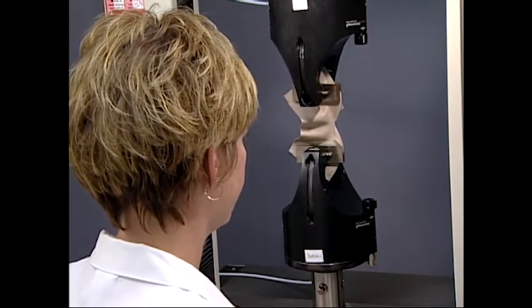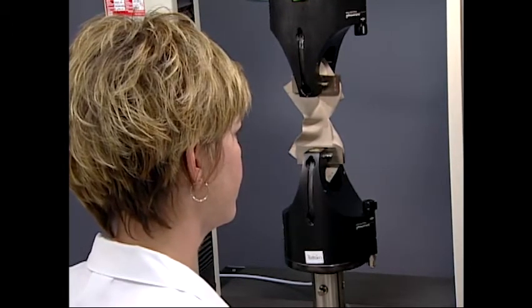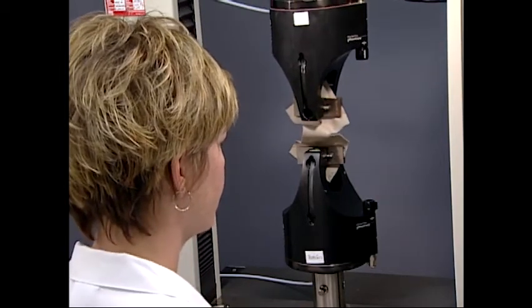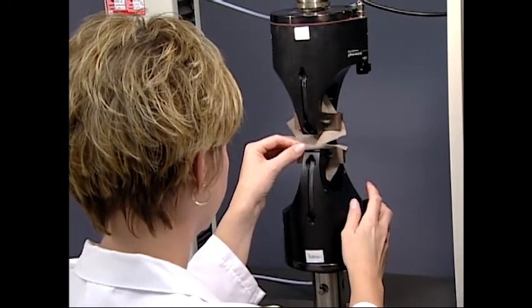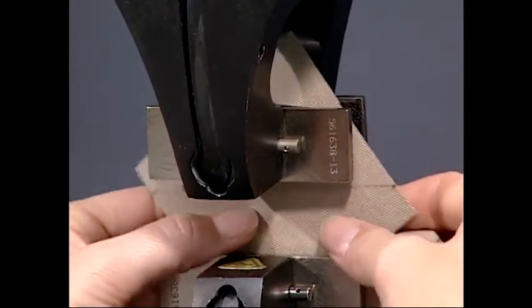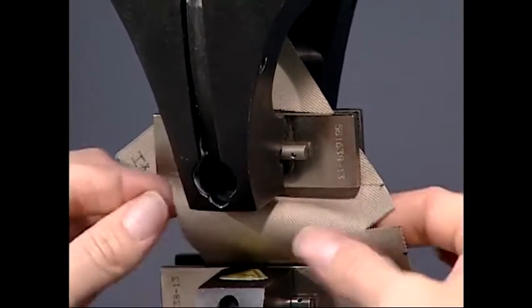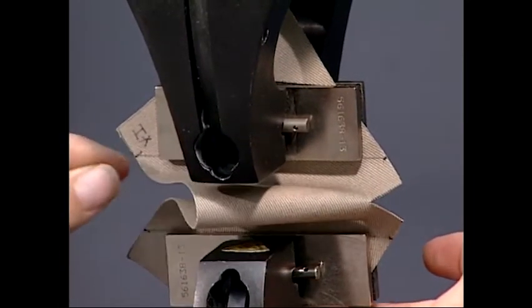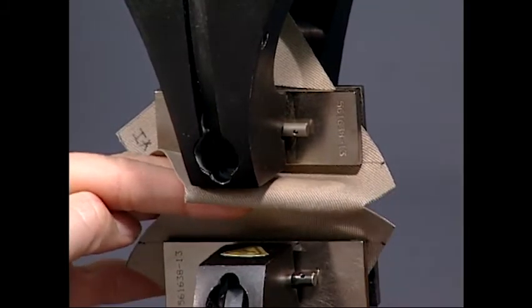The non-parallel edges of the trapezoid specimen are clamped into parallel jaws of the tester. A continual force is applied by the separation of the jaws to propagate the tear across the specimen. Simultaneously, the resultant force is recorded. Depending on the construction of the specimen, the tearing force may be represented in the form of a peak or peaks. High peaks reflect the strength of the yarn components, individually or in combination, needed to stop a tear in fabrics of the same construction. The valleys between the peaks have no special significance.